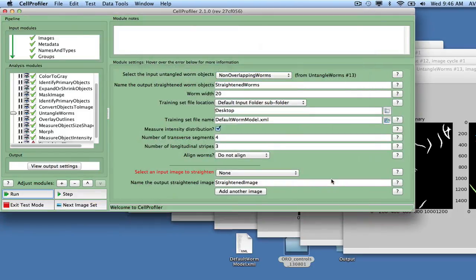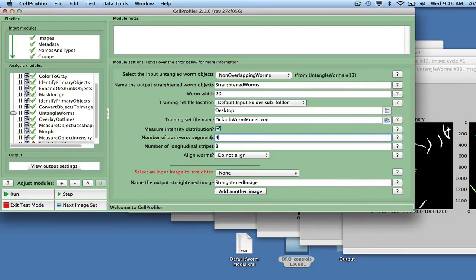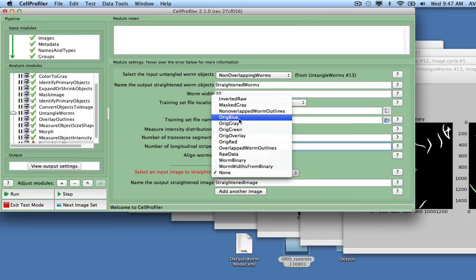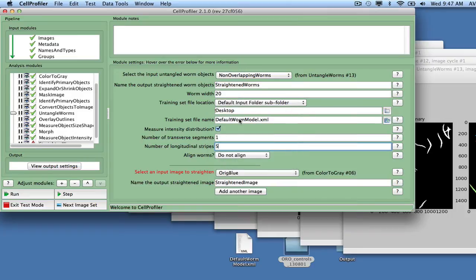In this module, we select Non-Overlapping Worms to Straighten and specify the default Worm Model.xml file as the training set. We then select a single transverse segment and five longitudinal stripes. Note that if a head marker was available, all worms could be automatically aligned. We select OrigBlue as the image for measurements.